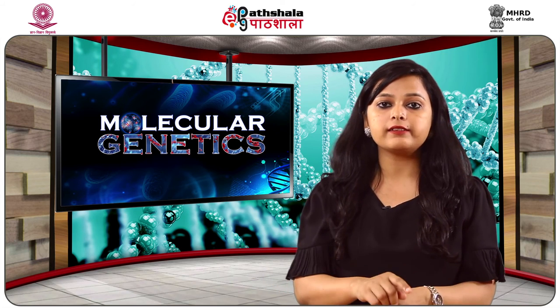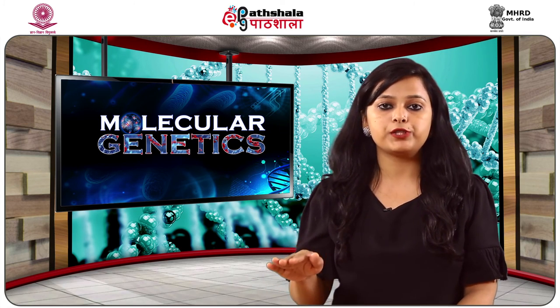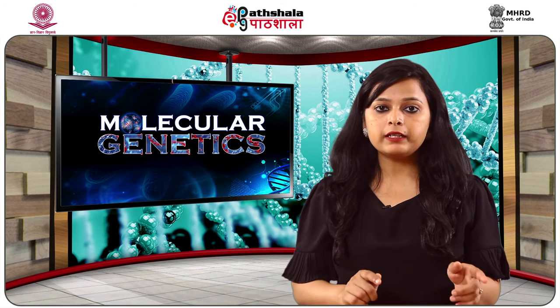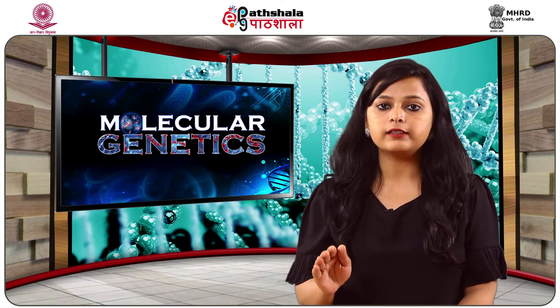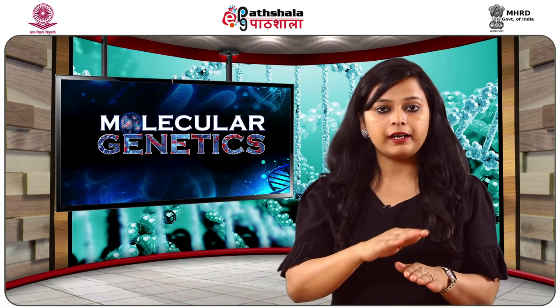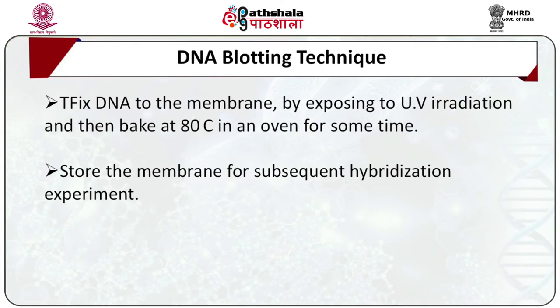Next day, the blotting sheets and the Whatman paper are removed from above the gel. The position of the gel slots on the membrane is marked. The membrane is then washed with 6x SSC, that is sodium chloride, sodium citrate, placed over a clean blotting sheet and dried at room temperature. To fix the DNA on the membrane, the side of the membrane carrying DNA is exposed to UV radiation and then baked at 80 degrees centigrade in an oven for some time. After Southern blotting, the membrane is stored in the folds of blotting sheets for the subsequent hybridization experiment.